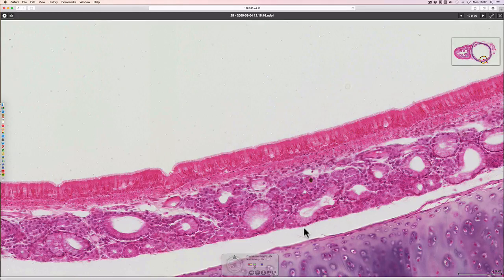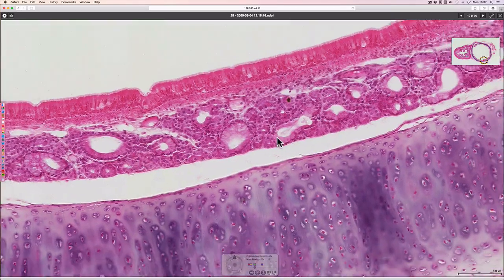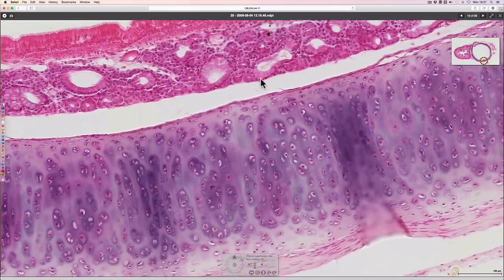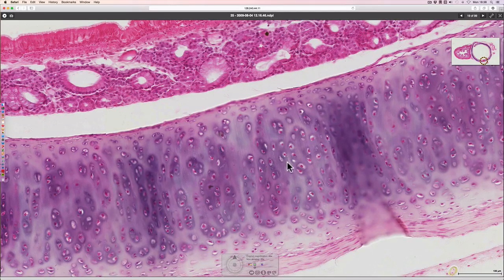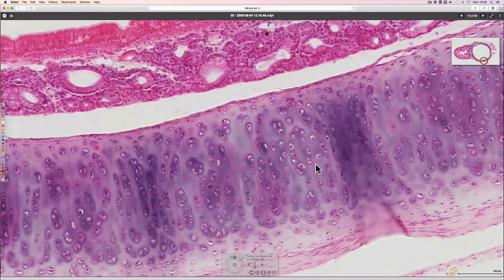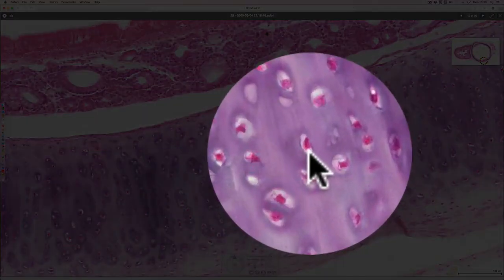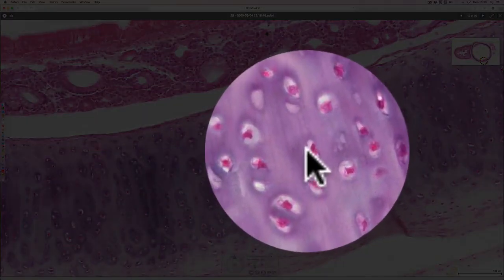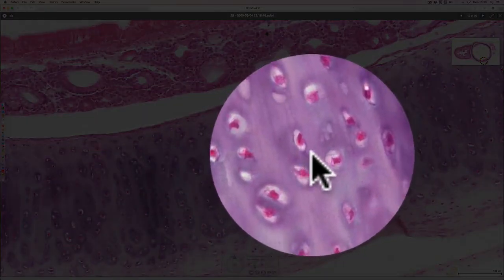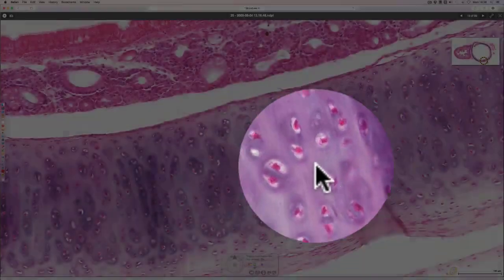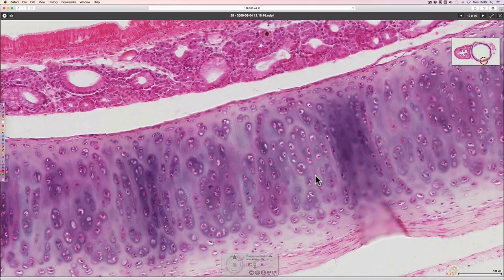Deep to that, we find some hyaline cartilage. Hyaline cartilage is so named because it's quite glassy and amorphous looking — the matrix is very structureless. The actual cells are these little pink things, called chondrocytes, and they sit in a little lacuna, or hole. The matrix is type 2 collagen.